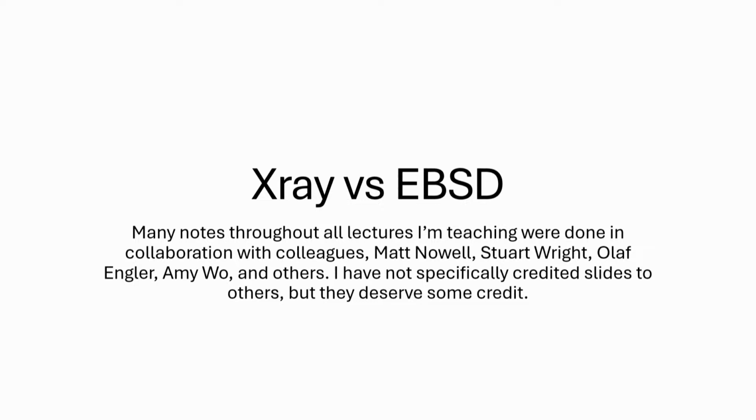between data that we get or analysis that we can do from X-ray diffraction versus from EBSD and do some comparisons. So some of you have been asking me questions about textures from X-rays and when we should do EBSD and when we should do texture or when we should do X-rays. So this is hopefully to start addressing some of those issues.